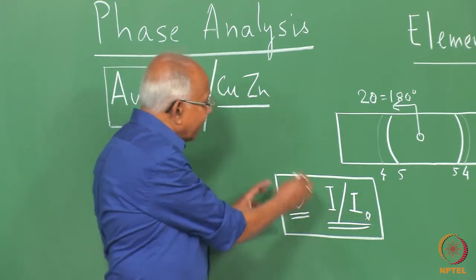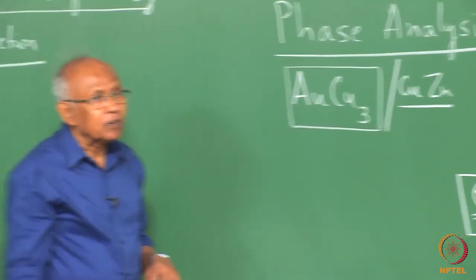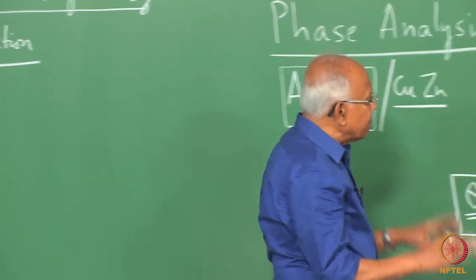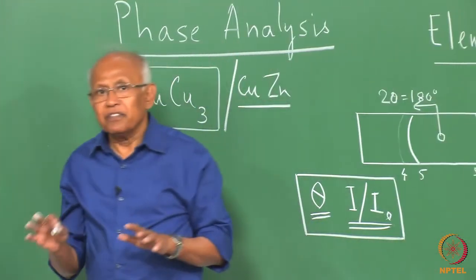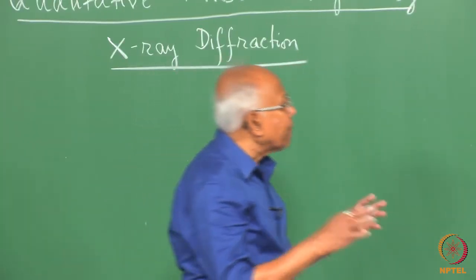So, these two together will constitute what is known as the diffraction pattern. So, no two elements or compounds or phases can have the same diffraction pattern.